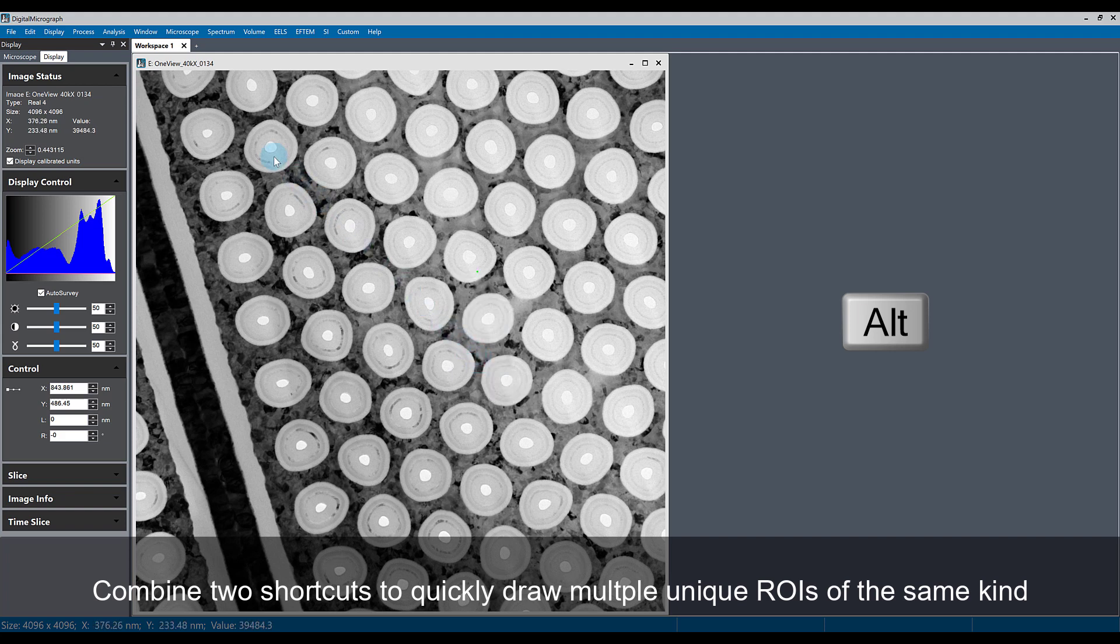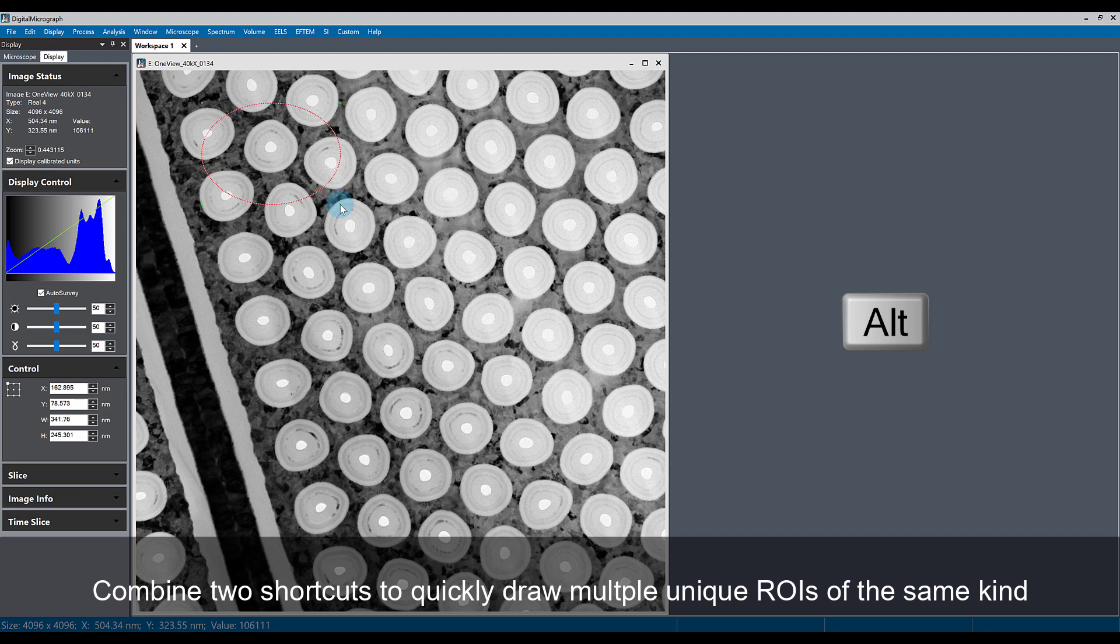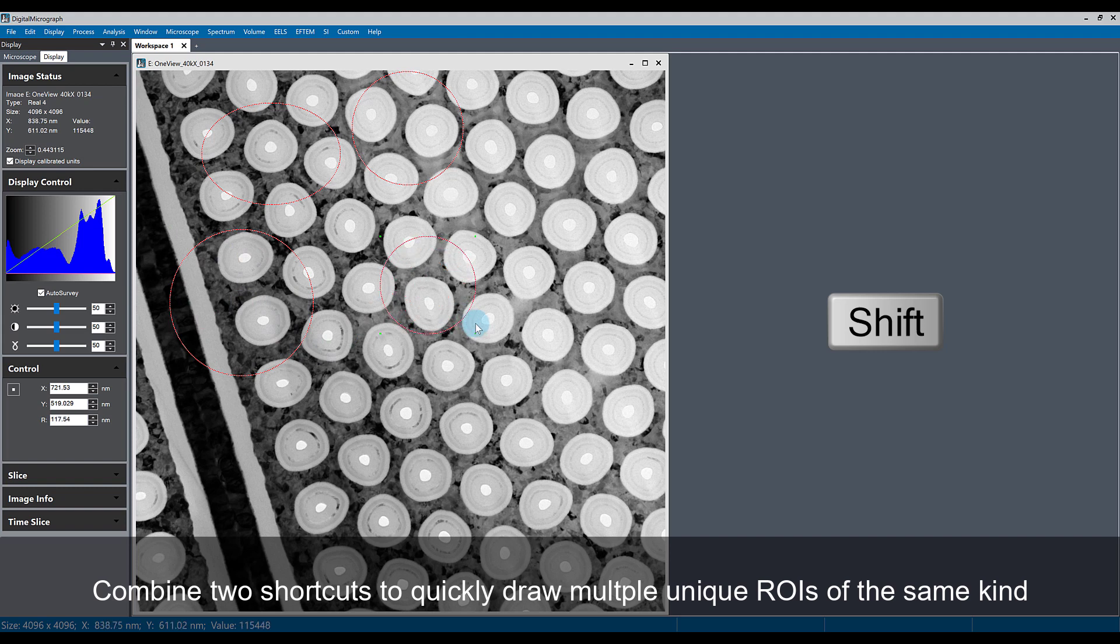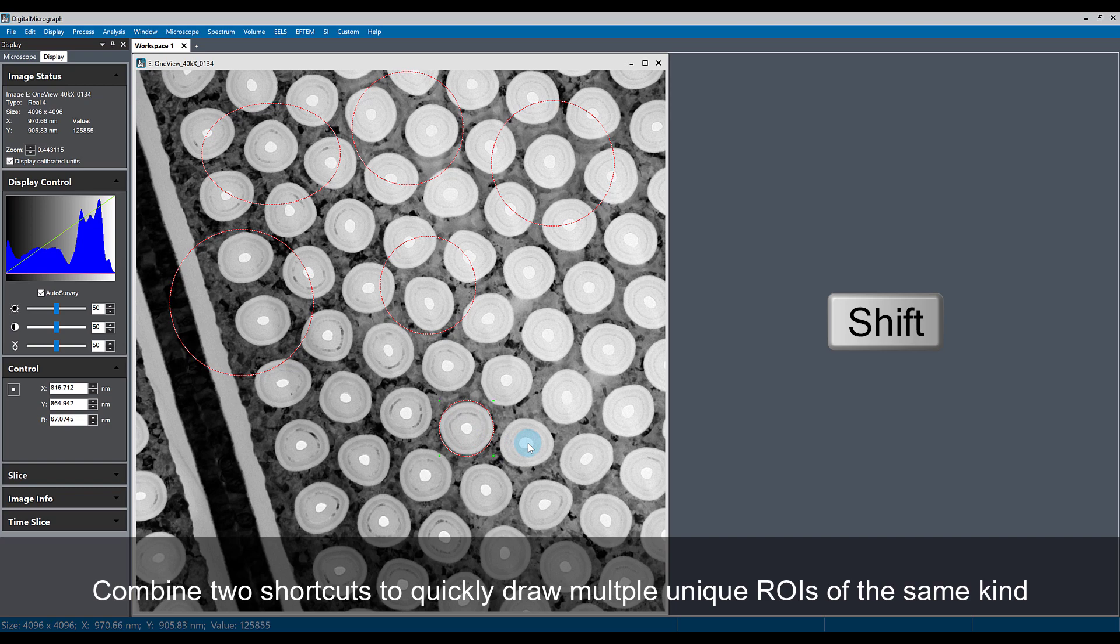And if I hold the shift key, I can draw multiple types of circle ROIs at the same time and select multiple of these structures.